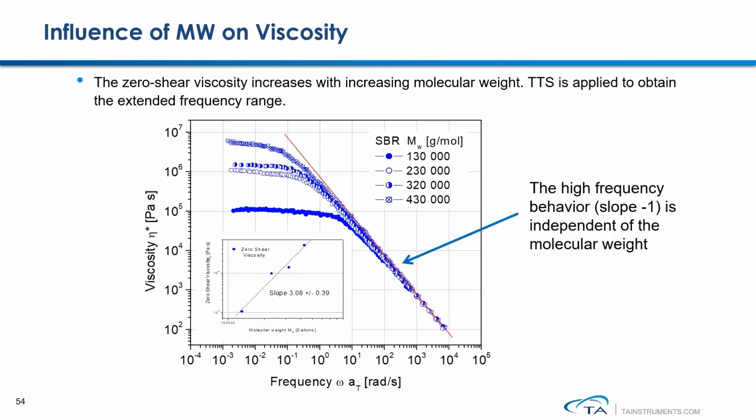As we have discussed before, since polymer melts are viscoelastic, edge fracture always limits shear flow measurements to low shear rates. So to study the rheological properties of polymer melts, most tests are conducted in oscillatory mode. Specifically, frequency sweep is the most commonly used method for studying polymer melt rheology.